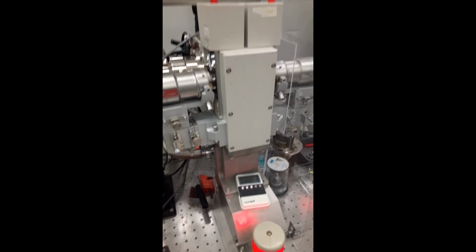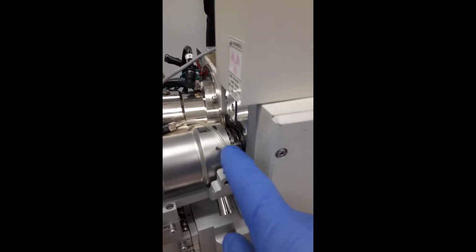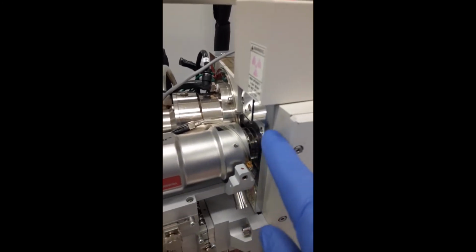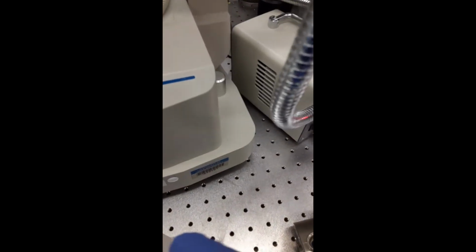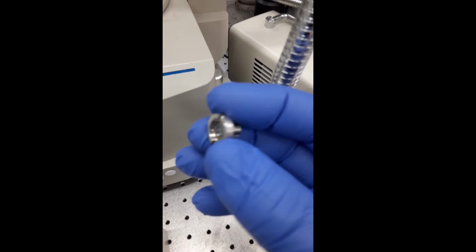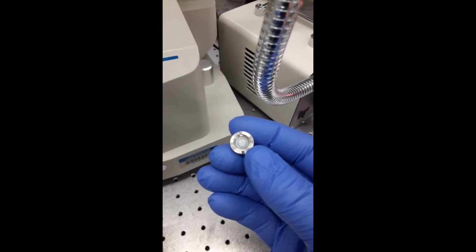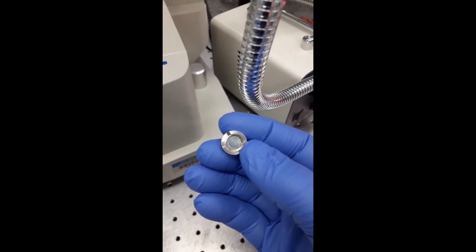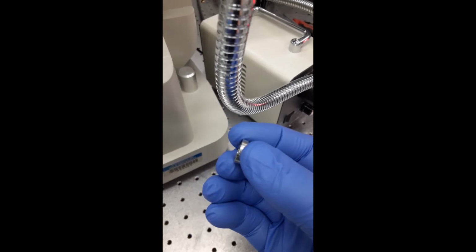Now, in order to use the X-rays, we have to let them out of the tube tower. So on each side, deep in here, in between the mirrors and the tube tower itself, is a beryllium window. Basically, a beryllium window is simply a hole drilled in the copper, and then this is screwed into that hole, and that little center part is made of beryllium. Now, beryllium is a metal that has a special characteristic where it is X-ray transparent, yet since it's a metal, it can be used to hold the vacuum.